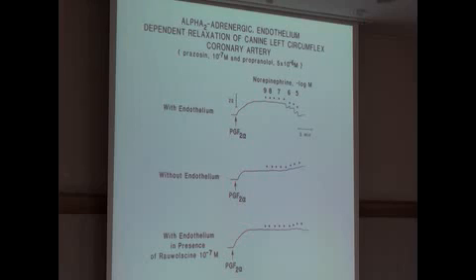I said that, I think, last time. And then we give increasing concentrations of noradrenaline. Note that this experiment is performed in the presence of a chemical that blocks beta-adrenergic receptors.